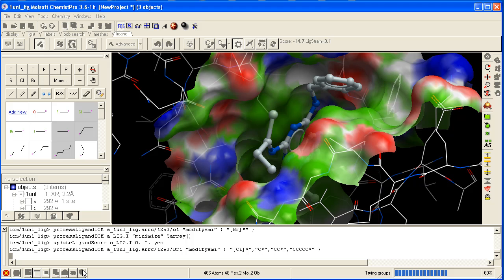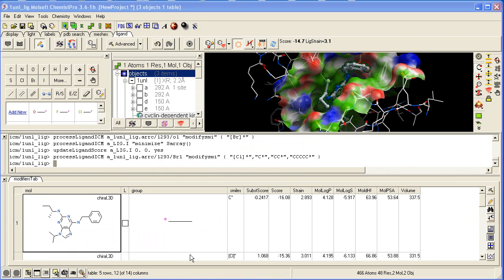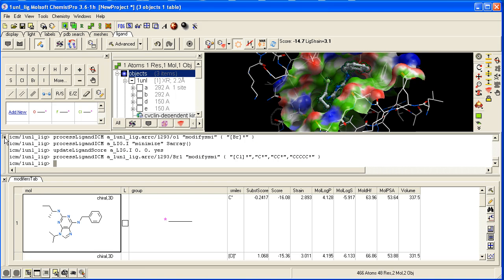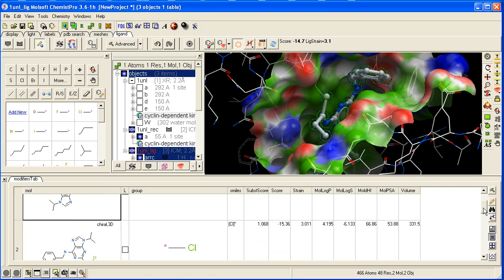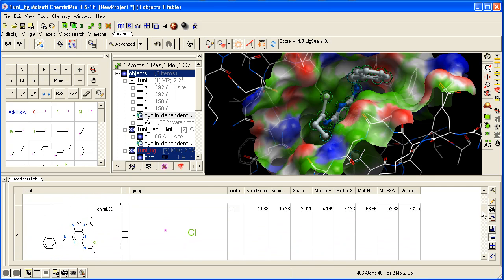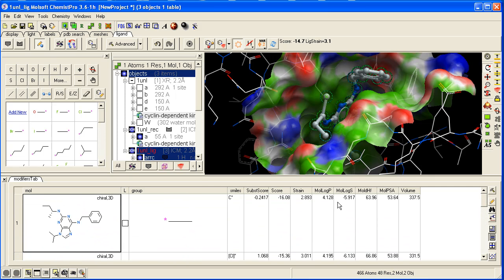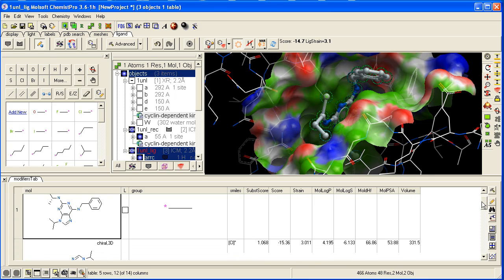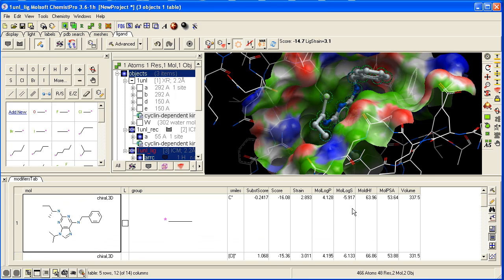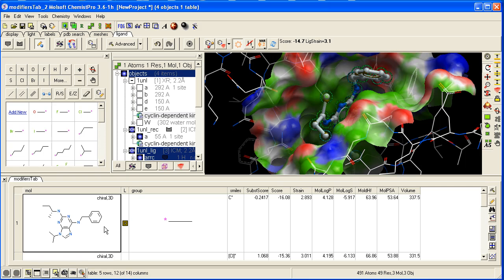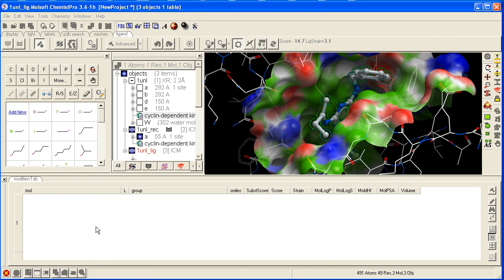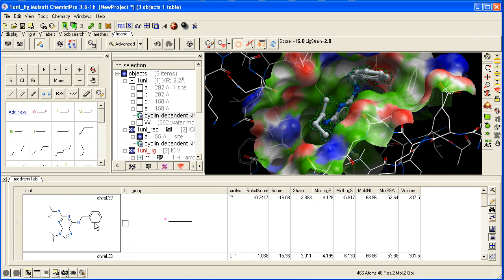It's trying each group and assessing the score. Once the screening is complete, a table will be displayed at the bottom with the substructure score and the overall contribution of each group, including the strain value. To view an addition, click here. To load it in, double-click here.